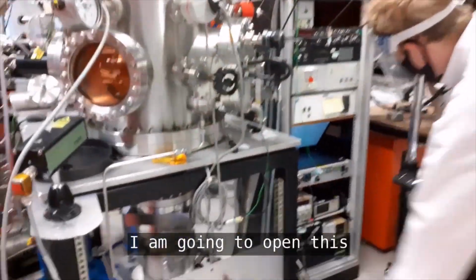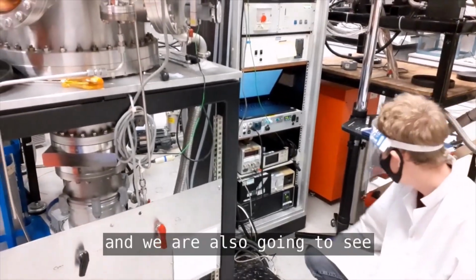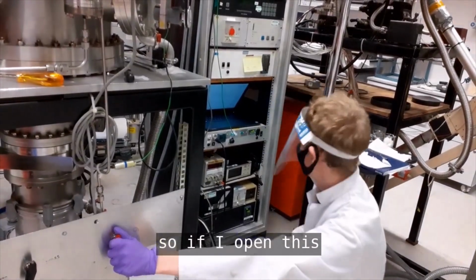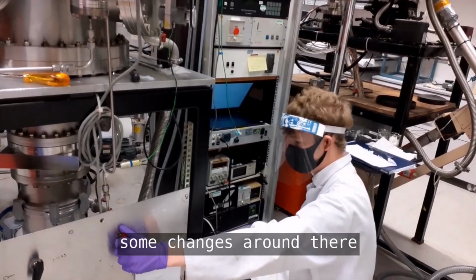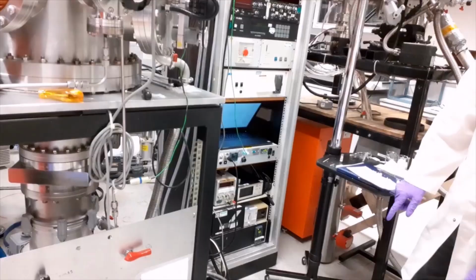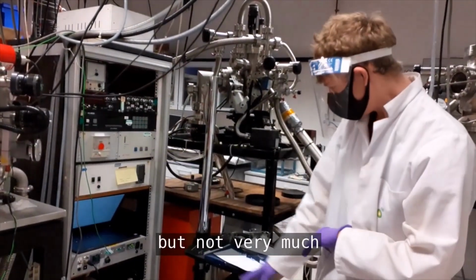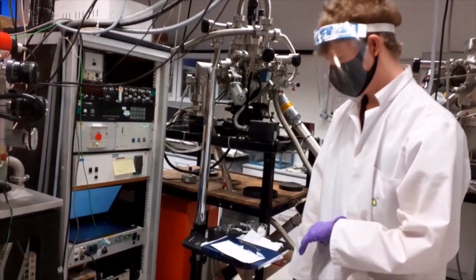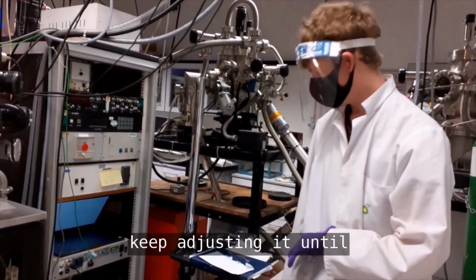And now, final step, I'm going to open this. That is going to send the pressure rising on here, and we're also going to see some change here. If I open this, you'll see this number here starts to increase. I've got that a little bit open, but not very much. The pressure's just starting to creep up, and we'll keep an eye on that, keep adjusting it until we reach the value we want.